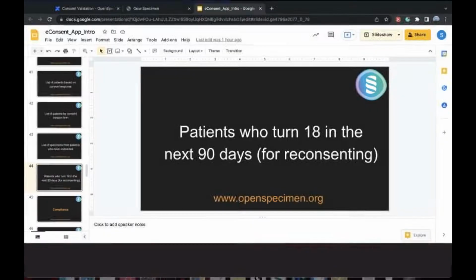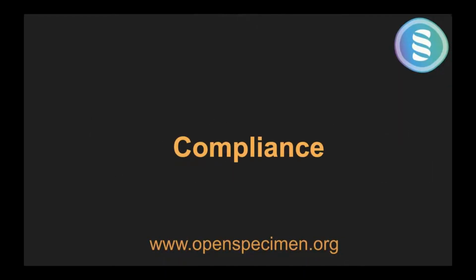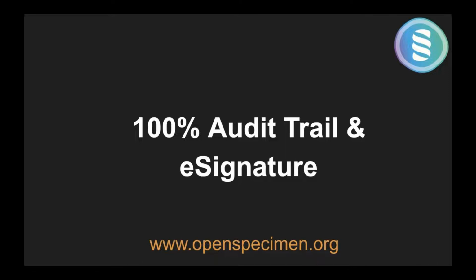Okay, so that's about most of the consent part. One of the key questions that we get asked when we talk about e-consenting is compliance. So again, like the rest of OpenSpecimen, all the consent data gets audited.